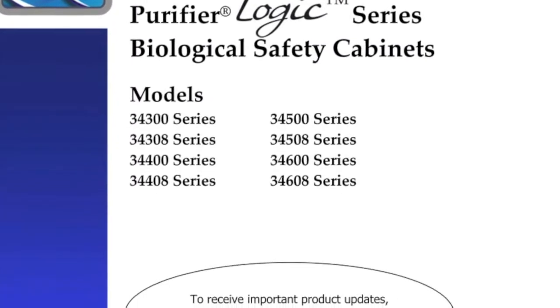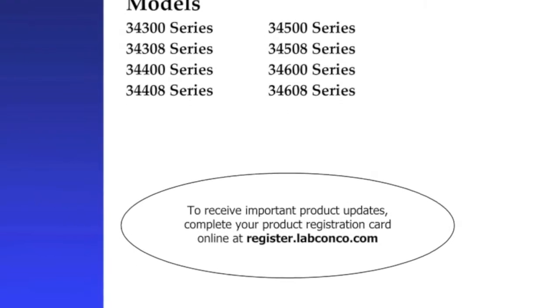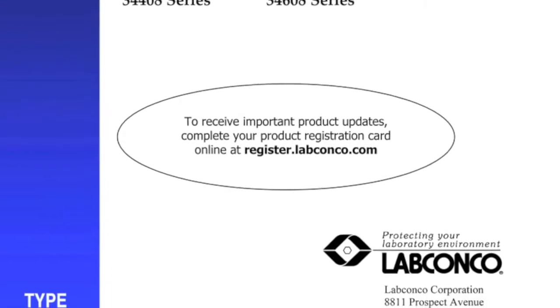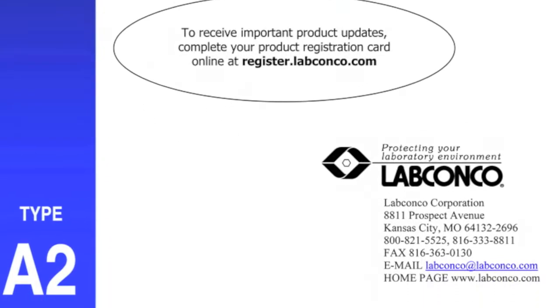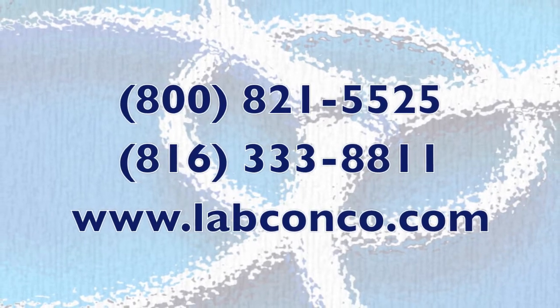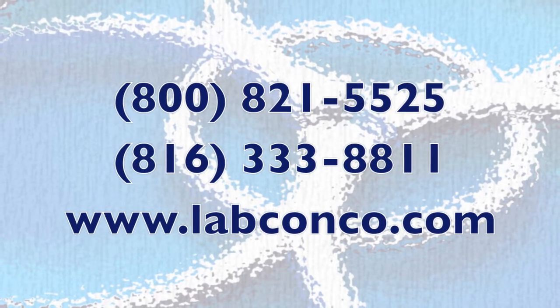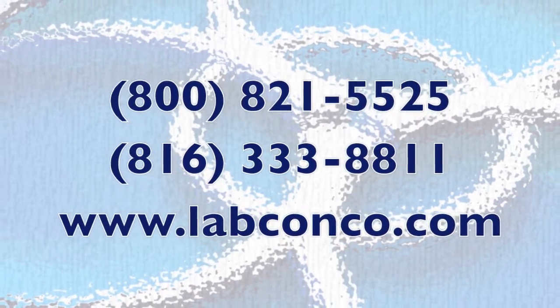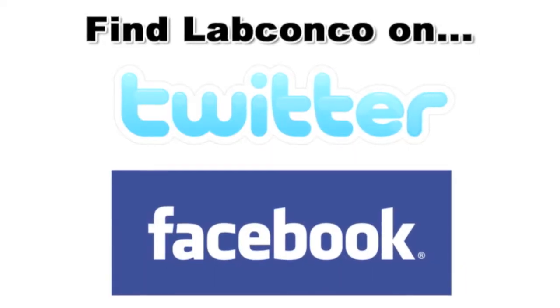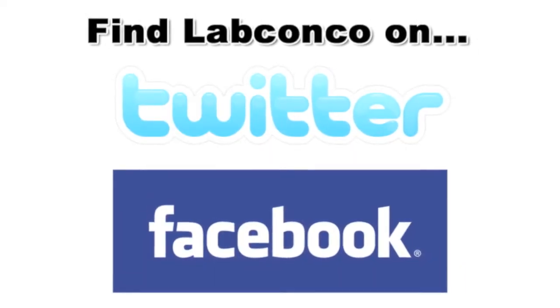Refer to the user's manual for further information regarding the proper operation and maintenance of the UV light. For more information, contact LabConco at www.labconco.com.